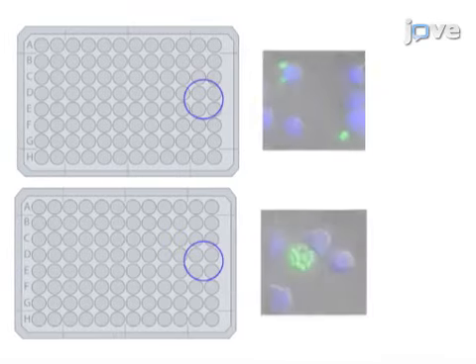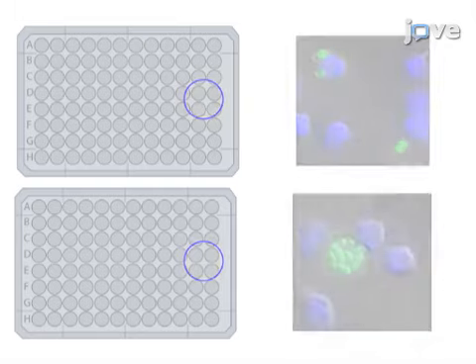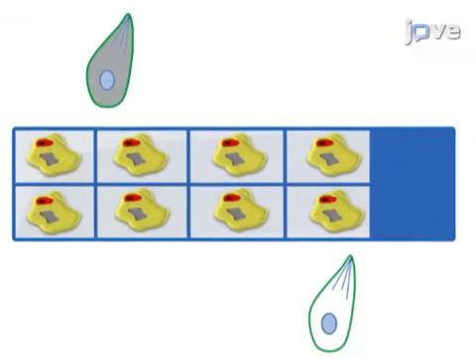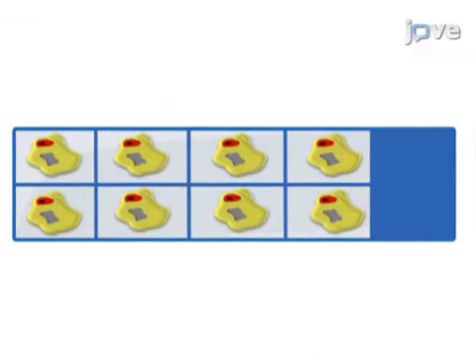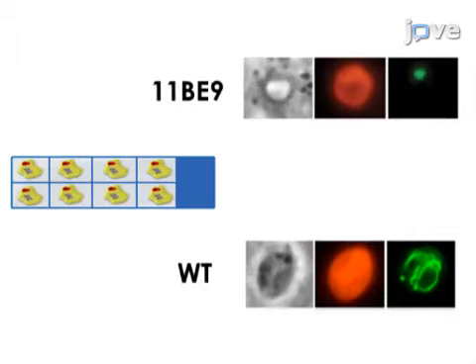Next, the infected cells are fixed, permeabilized, and stained with a polyclonal antiserum specific for Toxoplasma gondii and examined using immunofluorescence and phase microscopy to identify mutants that were unable to replicate or appeared in amorphous parasite-containing vacuoles following macrophage activation. The final step is to confirm the defect in each candidate mutant by evaluating its ability to replicate following macrophage activation in chamber slides that enable viewing of the parasite mutants at a higher magnification and resolution.